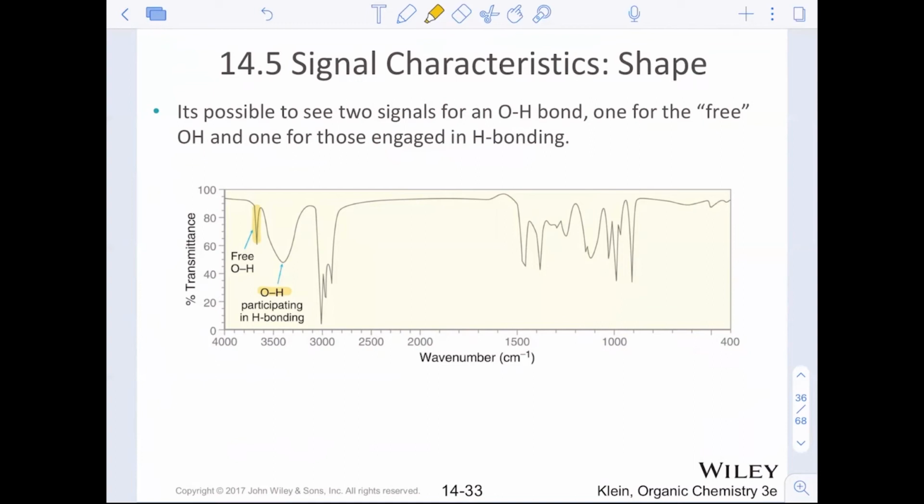When it isn't dilute, or when there's too much alcohol, or if you use a polar solvent, it doesn't need to be polar protic. Technically, it could be a hydrogen bond participator if it has an oxygen or a nitrogen or a fluorine in it. So with any hydrogen bonding capabilities, you'll see this broad signal. Typically for our in-class practice problems, we see broad signals.